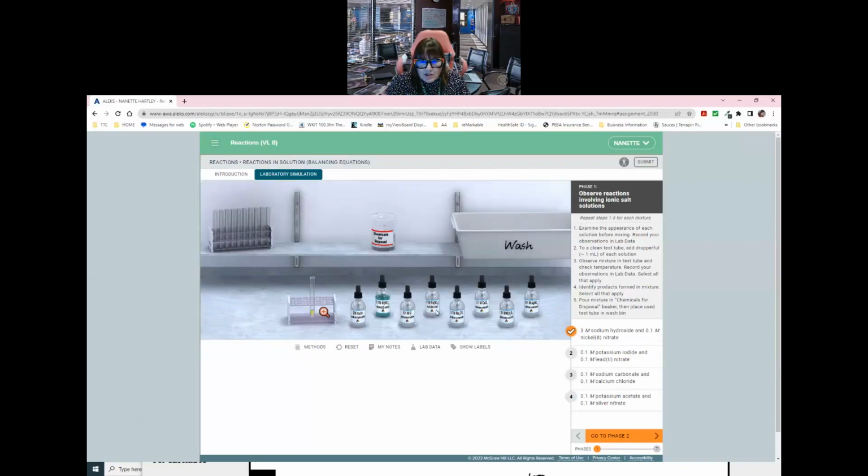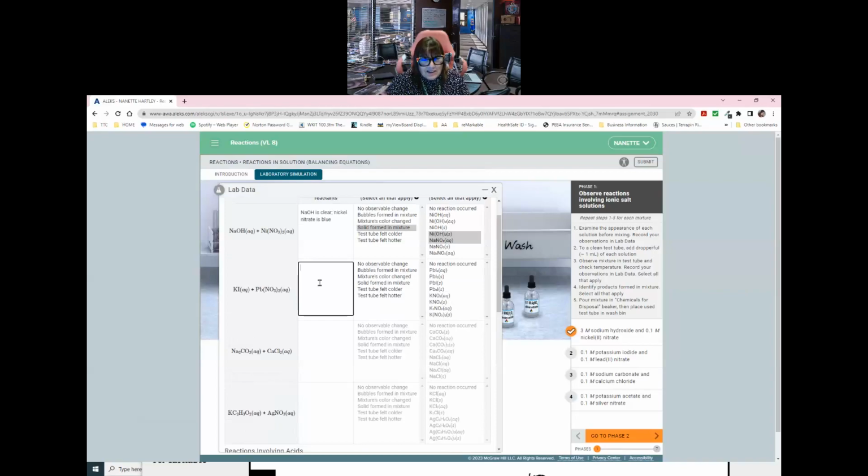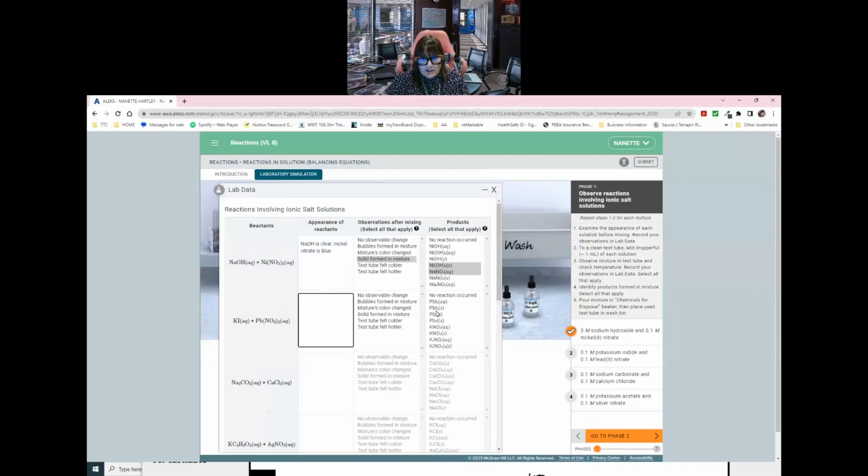I mixed potassium iodide with lead 2 nitrate. That's not what I was supposed to do. That was this one. Oh, I skipped one. That's why. Oops. So I did form a solid there. It was not hot when I did this.